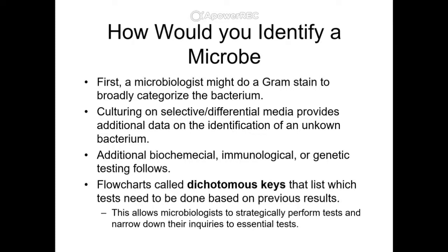Very commonly, first, a microbiologist might do a gram stain. And a gram stain will very broadly categorize the bacterium as gram-positive or gram-negative. And will also tell you the shape and size of that bacterium as well.